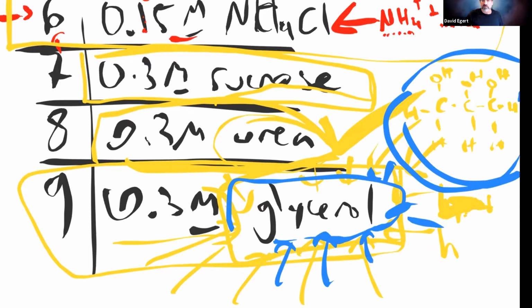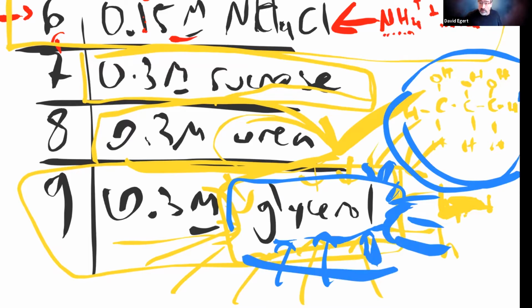This is another thing I've learned from doing this lab for a long time. When we used human cells, we always found the glycerol pretty much lysed everything. Then we started doing it with cow blood, and it's like, whoa, the cells look happy. We looked deeper and found a paper on the relative permeability of glycerol across different species.